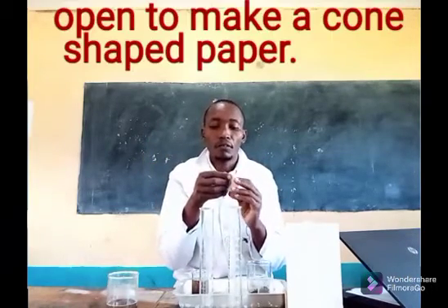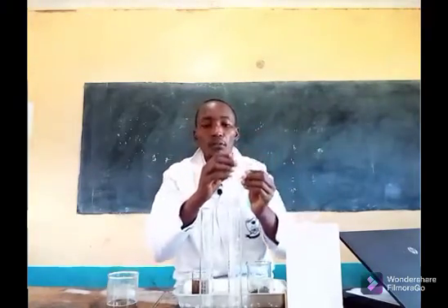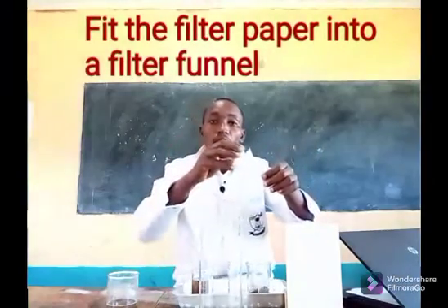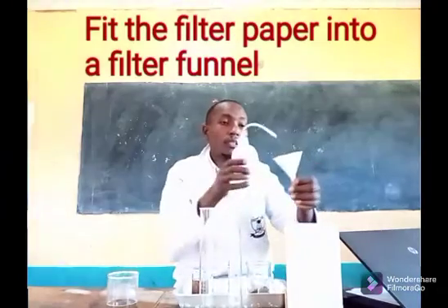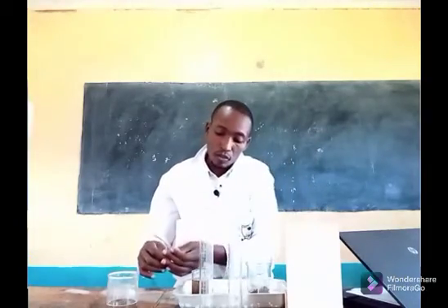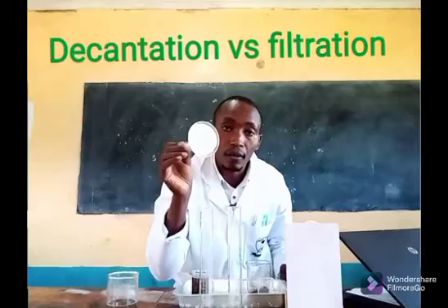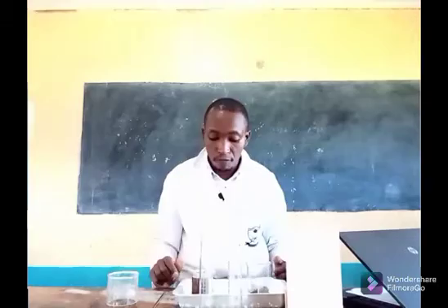Then I have to just get an opening to make a cone-shaped paper. There, you can see, it's in the form of a cone. So this one now is what I place on the filter funnel. I can add some water. If I just add a little water there, I'm just trying to make the filter paper stick. So the filter paper is stuck on the filter funnel, and then I'm ready for the filtration.